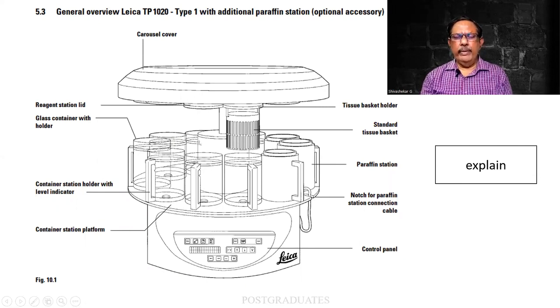This will be preventing the evaporation of the fluid. Most of them will evaporate. Take it to be alcohol or xylene or whatsoever. They have got a tendency to evaporate. And in order to prevent it, there will be a lid that snugly fits. I won't say tightly fits.